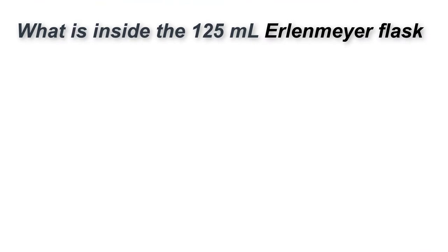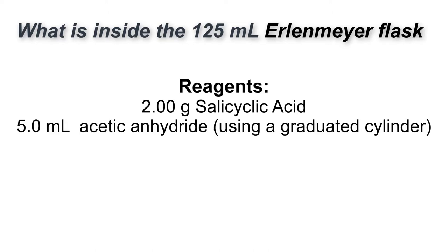Going into our 125 mL Erlenmeyer flask is going to be salicylic acid. We're going to put two grams of that in, and then we will also be putting in five mL of acetic anhydride.